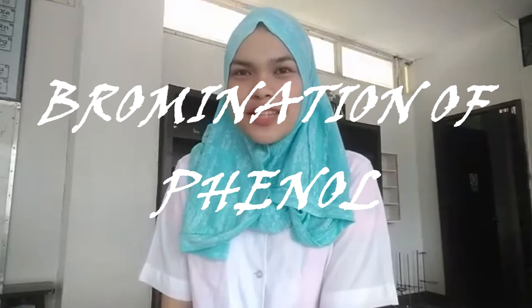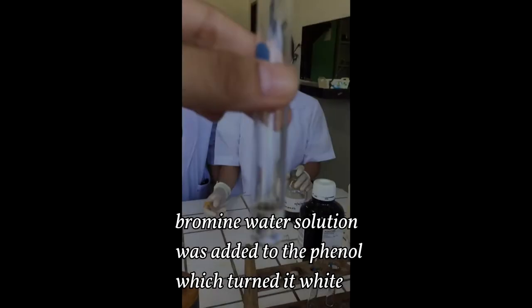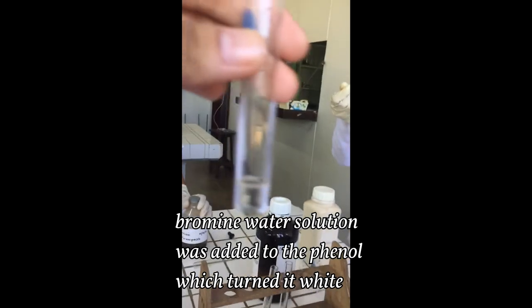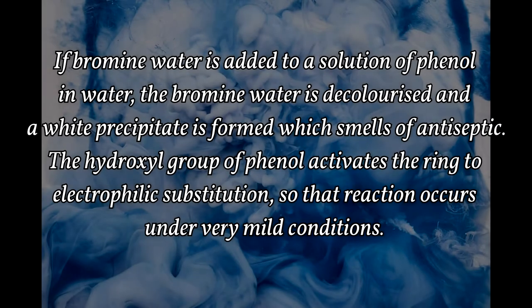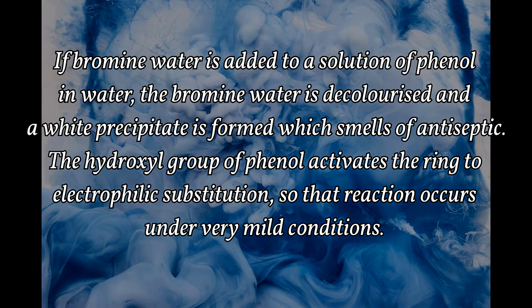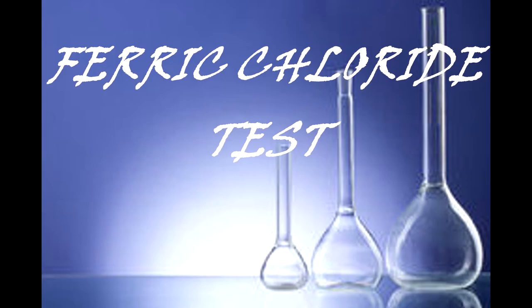For the bromination of phenol, add a drop of bromine water to 1 ml of each phenol solution. If bromine water is added to a solution of phenol in water, the bromine water is decolorized and a white precipitate is formed which smells of antiseptic. The hydroxyl group of phenol activates the ring to electrophilic substitution so that reaction occurs under very mild conditions.